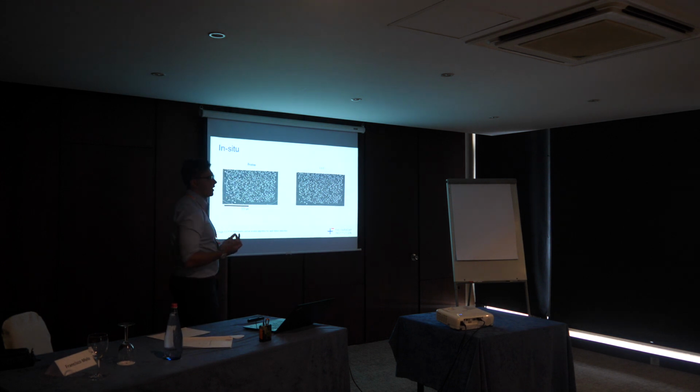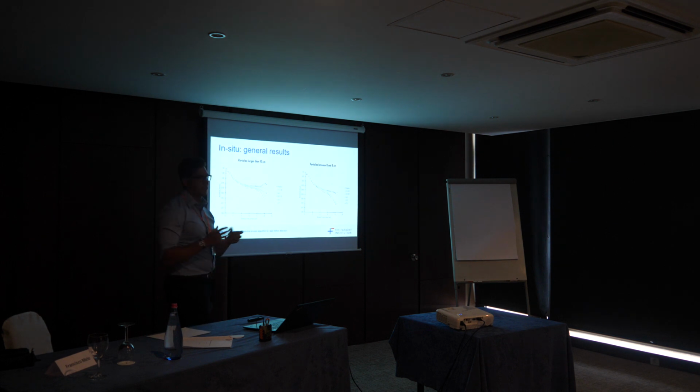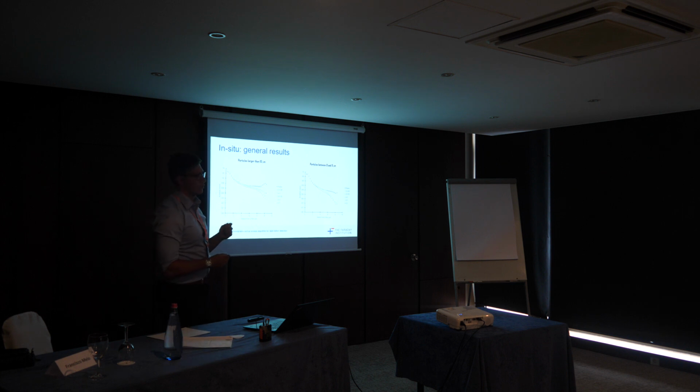One of the big questions you might have is, could the damage be caused by fabrication of your materials rather than this cycling behaviour? So we've done some in-situ work. We've taken the exact same electrode, taken it to a synchrotron, and imaged it at different points in its life. And again, we've done the same kind of normalised intensity tracking. And what we see is that the pristine and the fully discharged, with the top two lines, show the least amount of damage, and then the stuff that's taken to the high voltage or on its way back down has this lower normalised intensity towards the core.